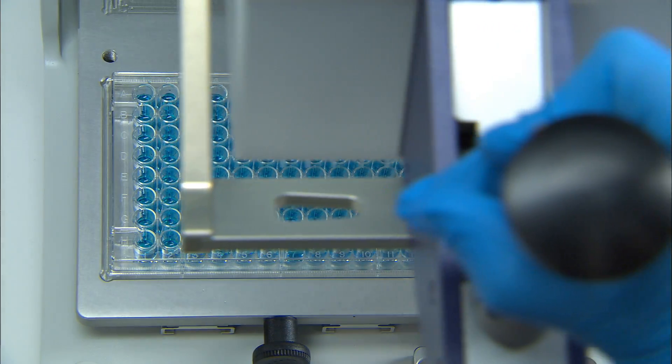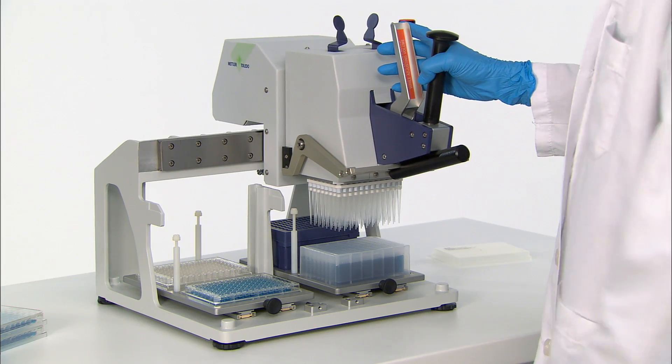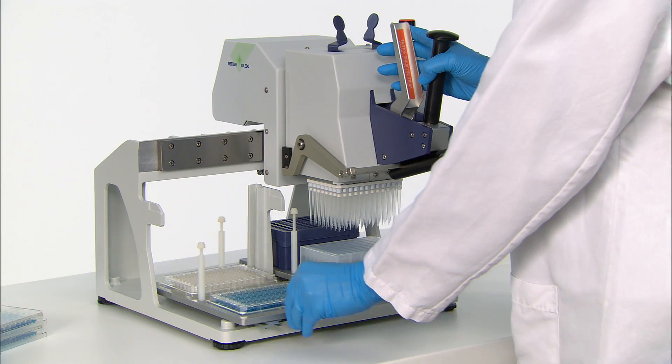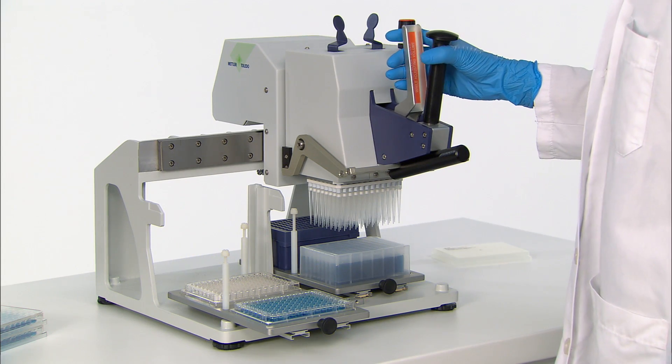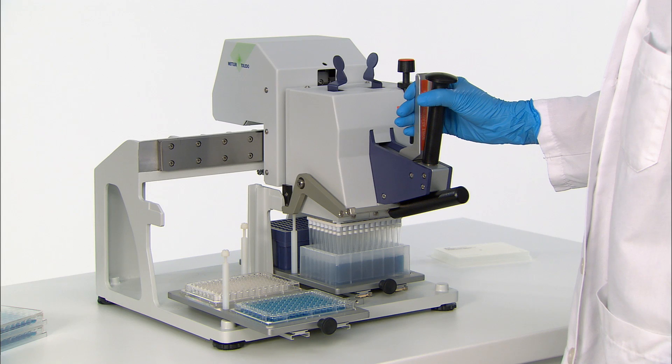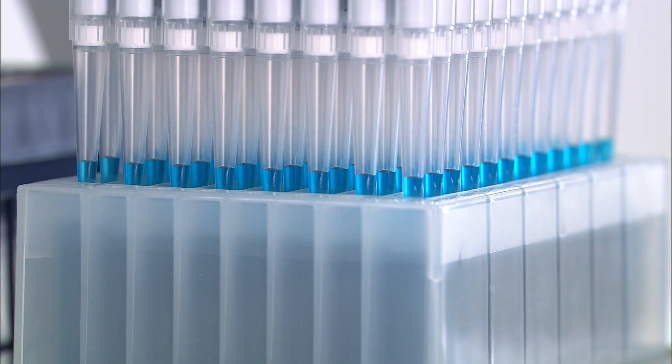The system is now ready to aspirate and dispense the liquid to the second 96 well plate. Move the left tray forward to place the second plate in the dispense position. Observe the absolutely level volumes in all tips.